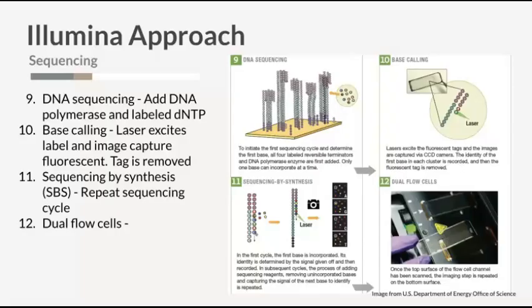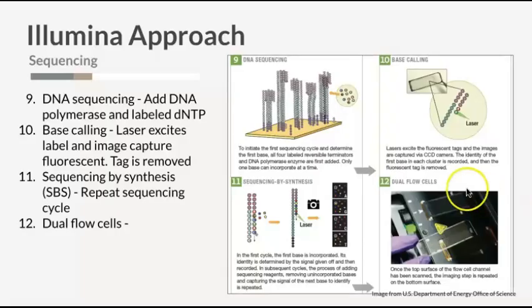It's hard to get enough coverage of that area because remember, the fragments are a smaller area. Let's say your gene is like 20,000 base pair. If you only have so much sample of DNA sequencing, you might not be able to cover that full 20,000 base pair region.